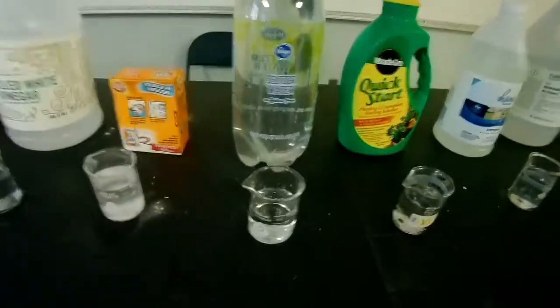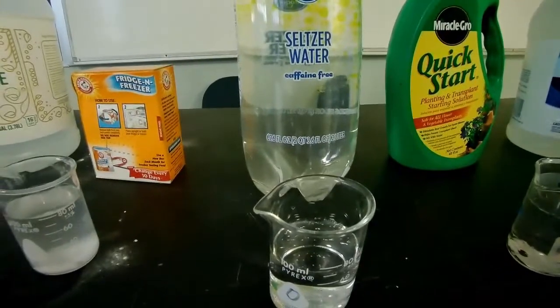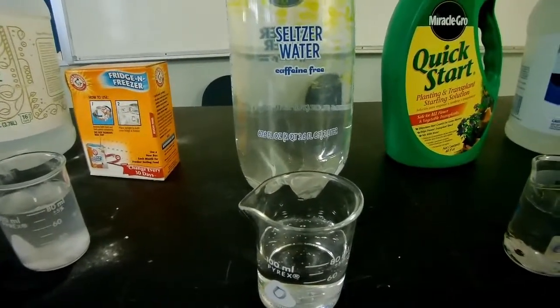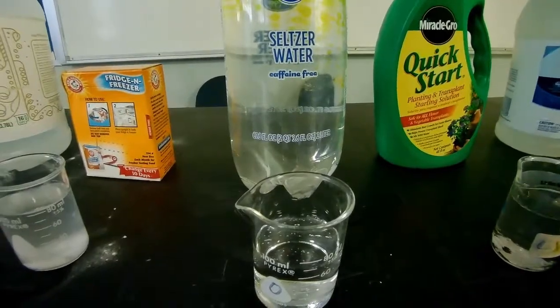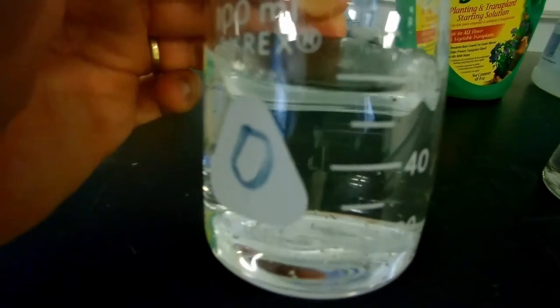All right, our next contender, chemical number 4, is going to be seltzer water. That's going to be carbonated water. So all it is is water with carbon dioxide dissolved in it. And that's what creates those little bubbles. So as we're talking about the description, we can see it's got some little bubbles to it, especially if I shake it. You guys have all had soda water before.